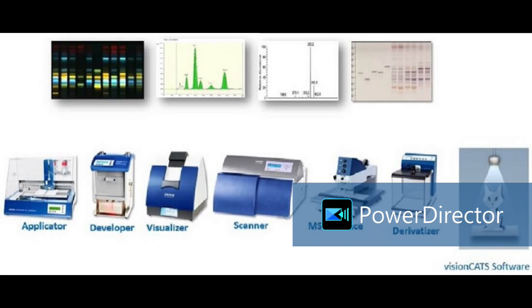Detected in nearly each sample. Some samples are from police, some samples are standards of ganja leaves, etc. They have applied, and at a time 27 different tracks they have compared together, 26 different samples, their fingerprints on a single screen. That is the speciality of the software, an additional feature in Camag HPTLC software. Different fingerprints at the same time we can compare on the same screen.